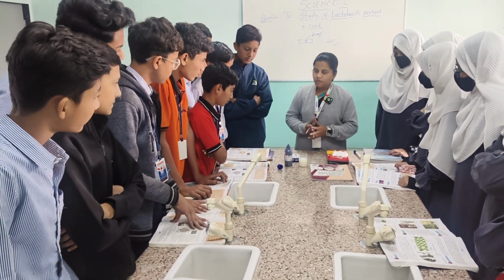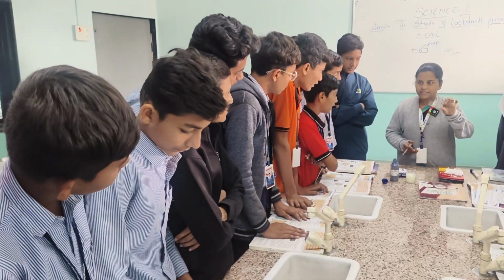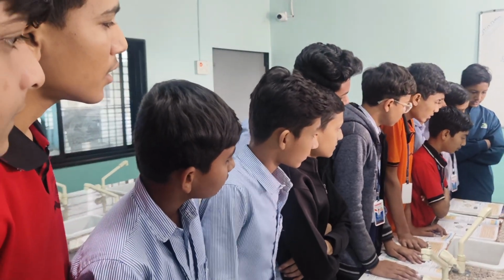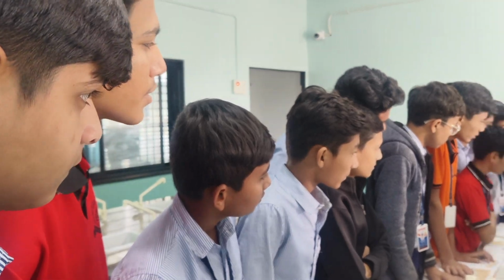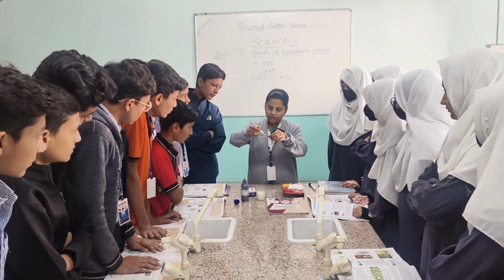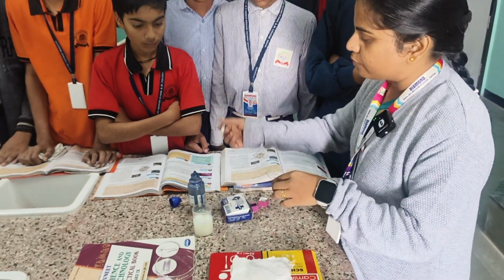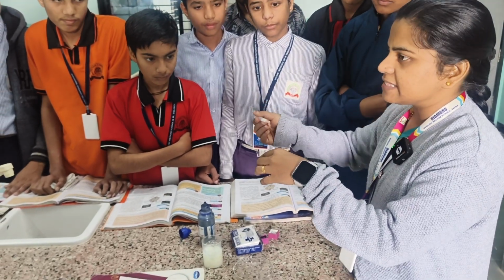First of all, what do we have to do? We have to take a glass slide and put a drop of curd on it with the help of a dropper. We have taken the drop of curd and put it on the slide.